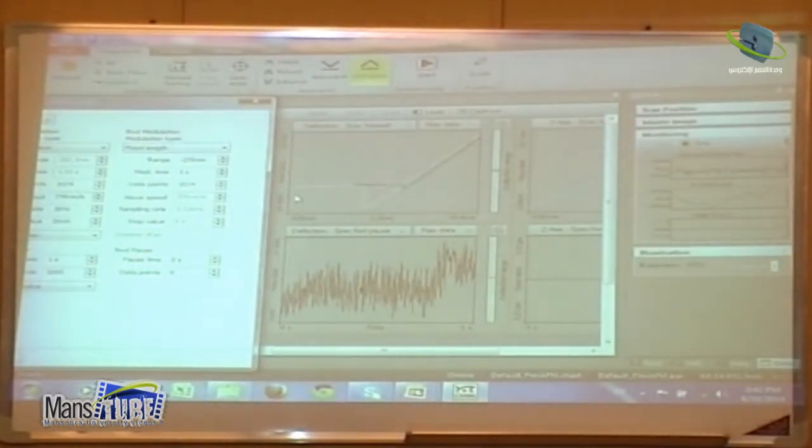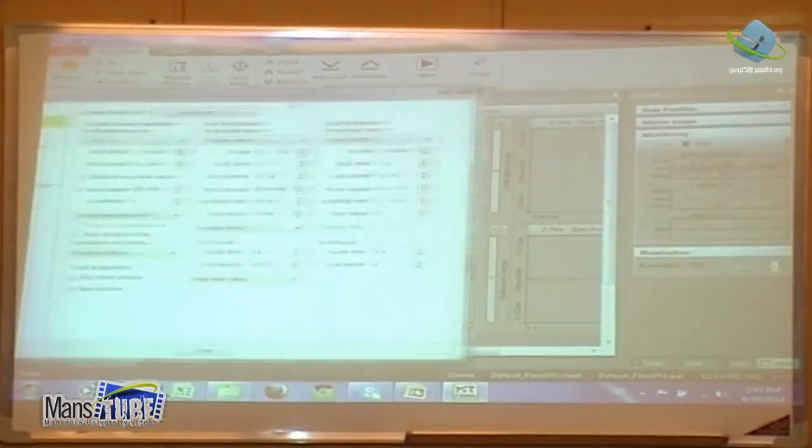So I am here, minus 200 is here. This is my 200, it starts like this. You see there is a small attraction first, and then it goes back until it reaches, let's say, 20 nanonewtons. Then it goes down until it reaches minus 256. It should be from here to here, minus 256, because this is 0. From this point, and then it goes back to minus 200.